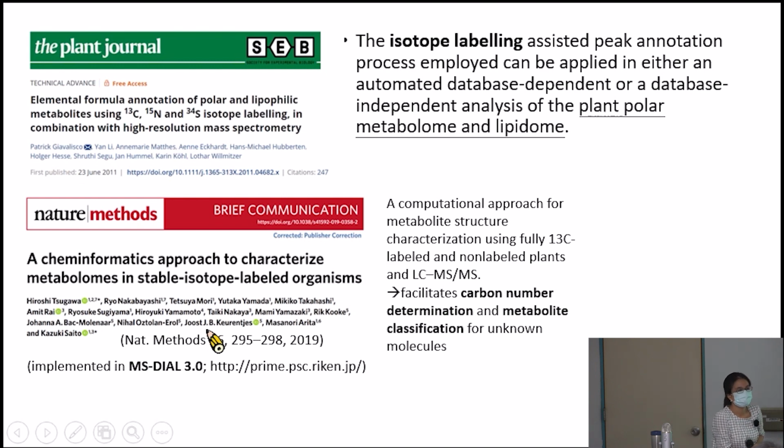Okay, the slide. The mass spec slide shows pretty much just one compound. Yes. But if you collect the metabolites from, for example, cancer cells, then they have millions of metabolites, and the peaks will be very complicated. So that's why they need to consider so many algorithms, and they need to have a good false discovery rate prediction, because this false discovery rate can help us remove some unreal, impossible metabolites.